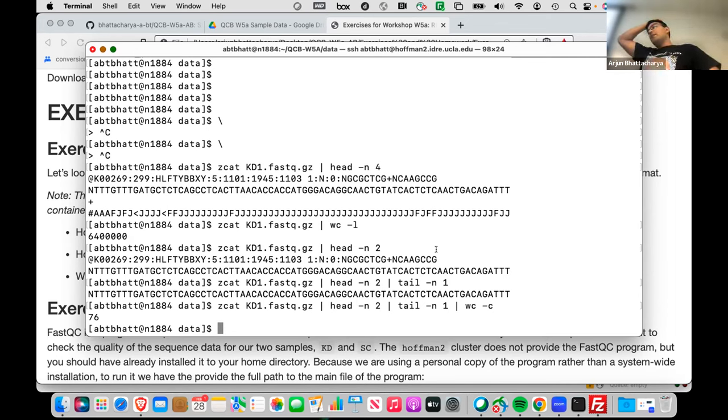But this is all stuff that, that's why I think we have an advanced Unix course now, because we're going to start teaching awk and sed and things like that, at least getting people started. Awk and sed give you good ways to manipulate the files. But also regular expressions, grep and grepl and things like that, are going to be a good way of trying to find matched strings or subset. These are not advanced, but they're stuff that you'll pick up the more you use Unix yourself. Okay, I think second question.